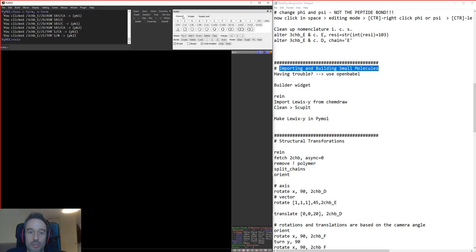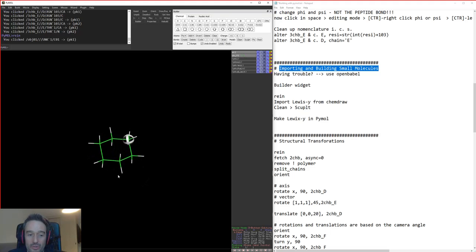and you can choose various different chemical groups. But we can create a new object here of what was going to become a sugar, for example. So we have this, and what we want to do is, if you want to make any edits to your structure, the first thing that you should do is click on the atom that you want to change, and then you can just use a different elemental selection up top.